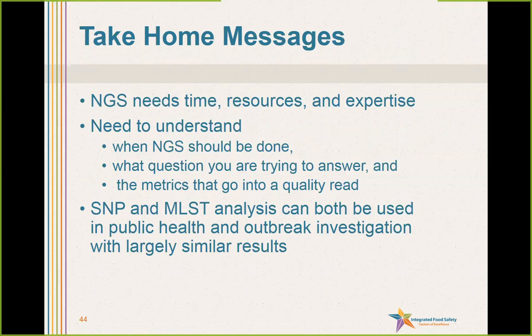SNP and MLST analysis both have a place in analysis. The two are not mutually exclusive. You can do both analyses with the same raw data. For some cases, MLST works better, and for others, SNP might work better. In important cases, it makes sense to use both approaches for data analysis.